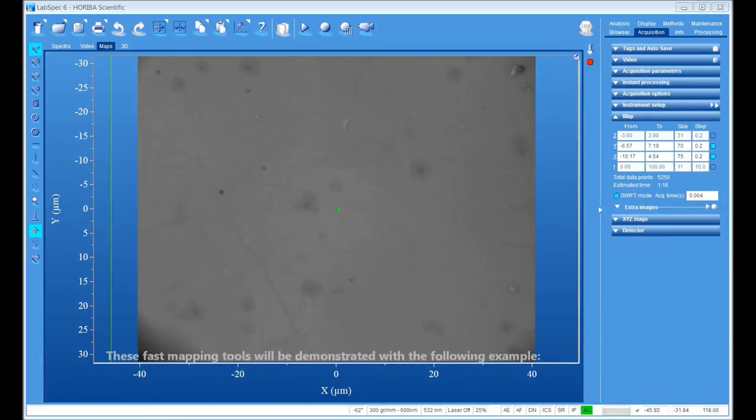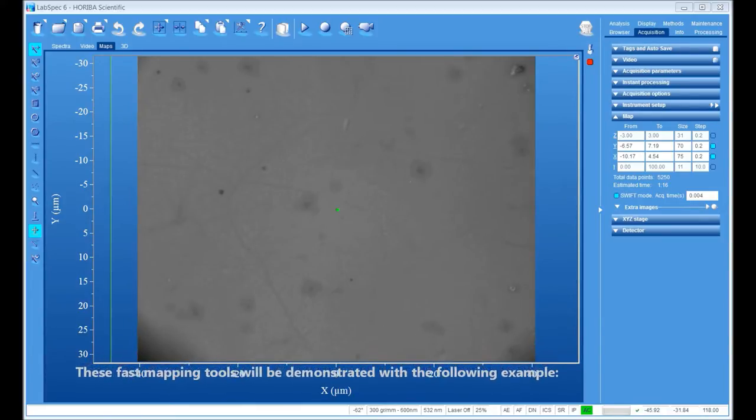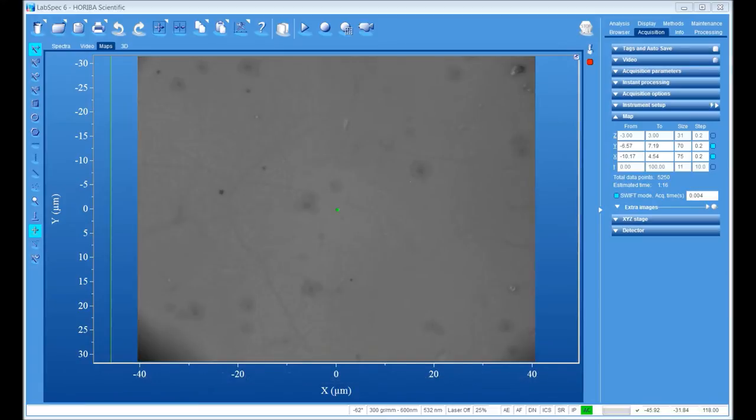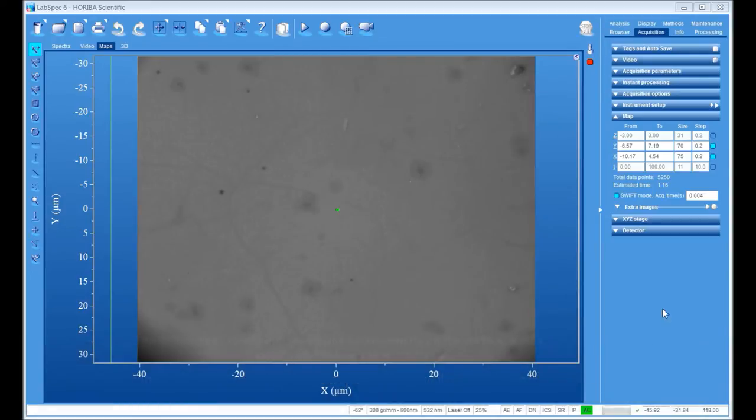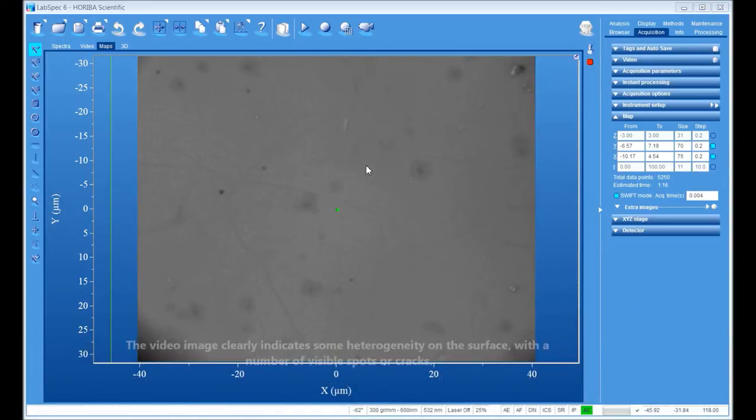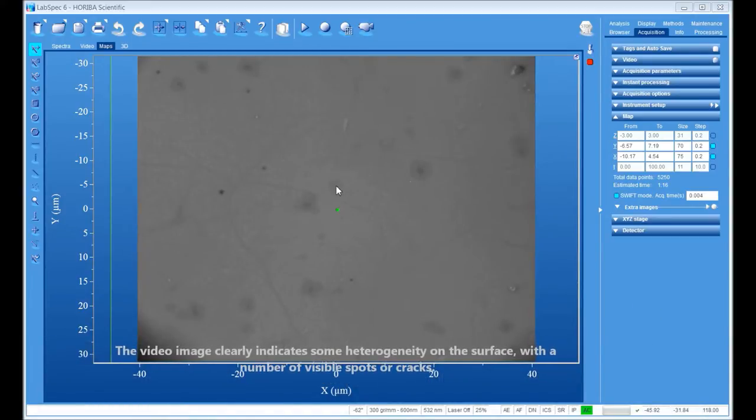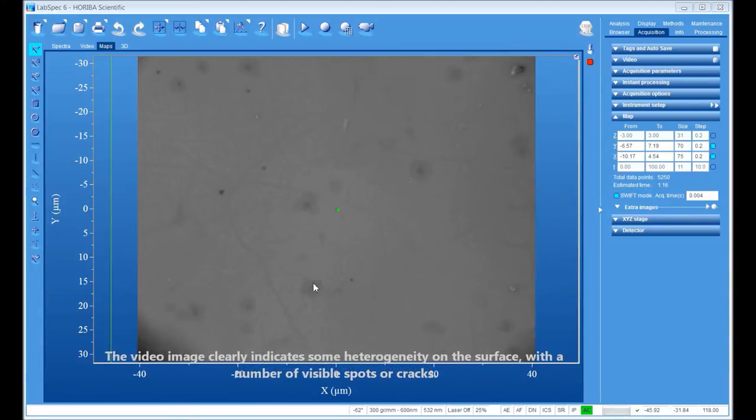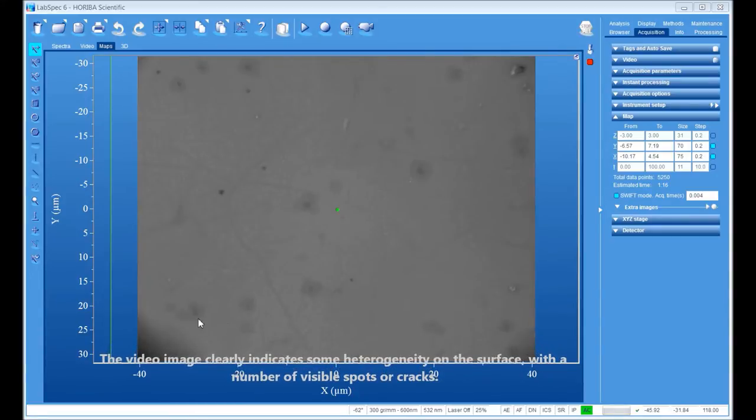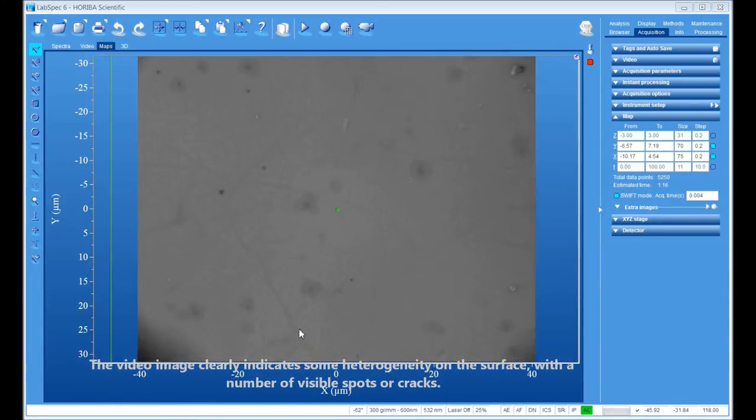The fast mapping tools will be demonstrated here with the following example. This sample is a bilayer graphene deposited on a silicon substrate. The video image clearly indicates some heterogeneity on the surface with a number of visible spots or cracks.